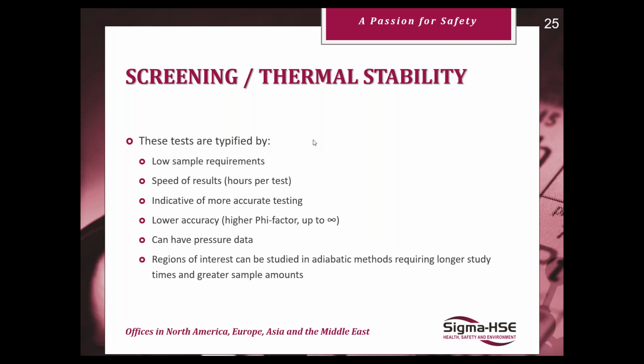If they're doing testing in-house, you can screen a large number of compounds within a small amount of time, especially with the DSC. As we've said before, this is indicative rather than more accurate testing. It's just to highlight whether you may have any potential thermal stability issues and whether there's anything worth investigating further and in more depth later.